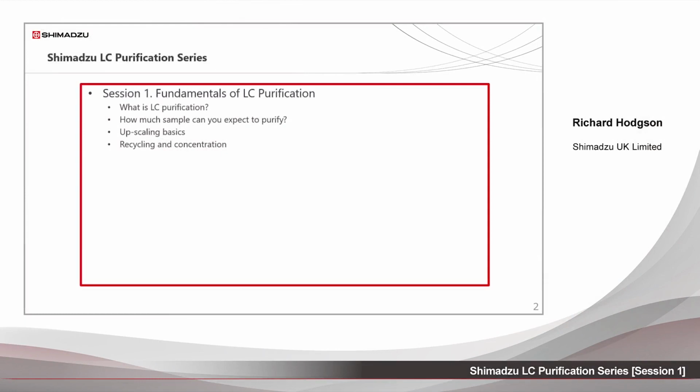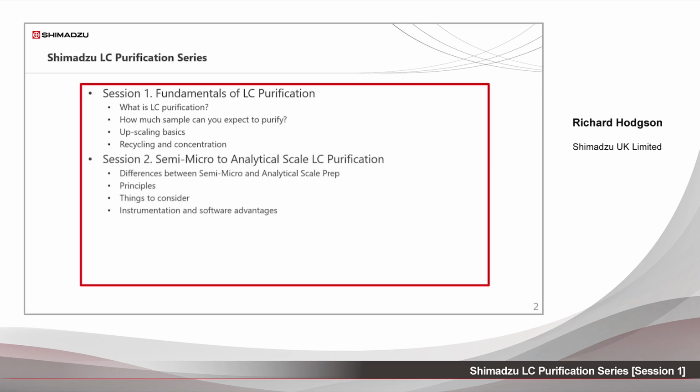The Shimadzu LC Purification webinar series will consist of 3 sessions. The first today is titled Fundamentals of LC Purification. This will include what is LC purification, how much sample can you expect to purify, upscaling basics, and recycling and concentration. Session 2, titled Semi-Micro to Analytical Scale LC Purification, will cover the differences between semi-micro and analytical scale prep, principles, things to consider, instrumentation, and software advantages.